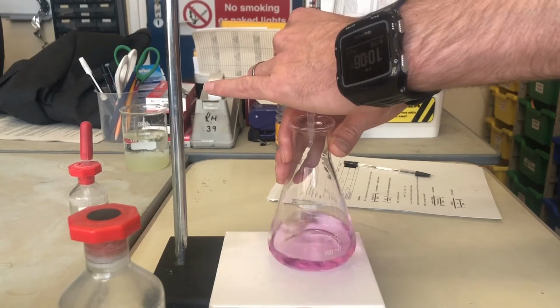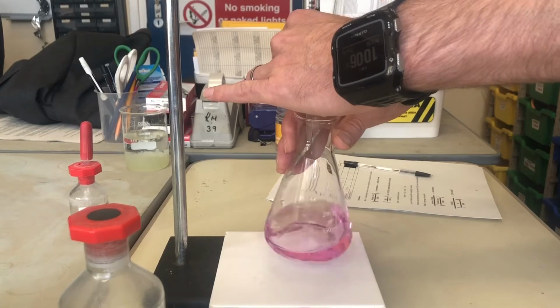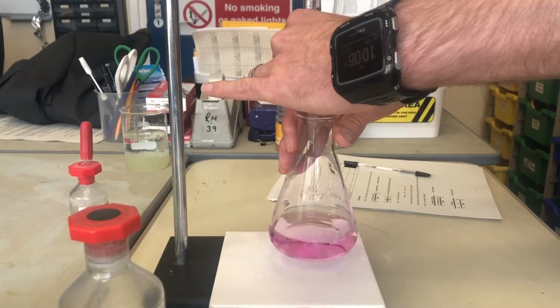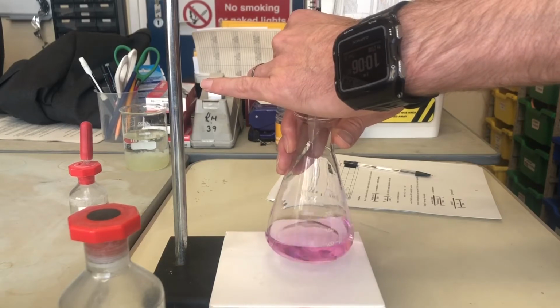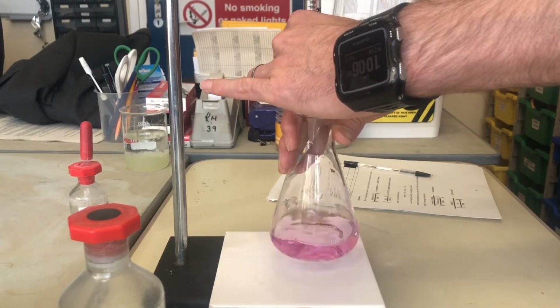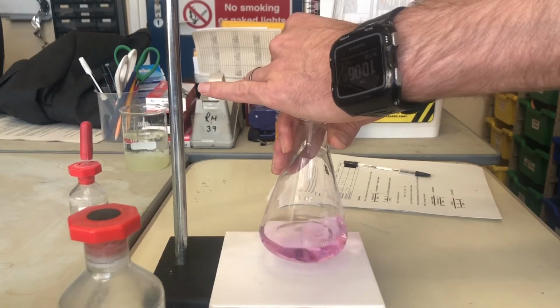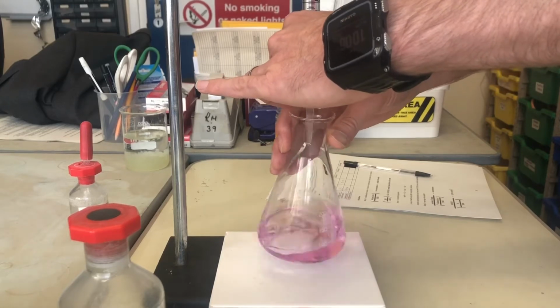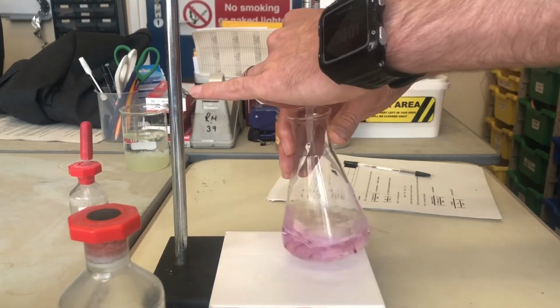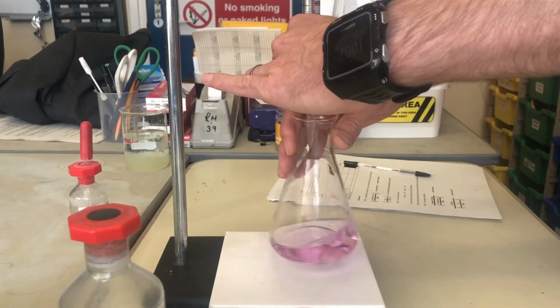Okay, because I've already done that rough titration, I know pretty much where that neutralisation point is. So I can slow it down at the key point to try and get an exactly neutral solution. It's only when we get that exactly neutral solution, I just want one more drop, I think. There we go. Is that gone? Let's have a slight pink tinge to it, so maybe one more drop. One more drop just to, there we go.